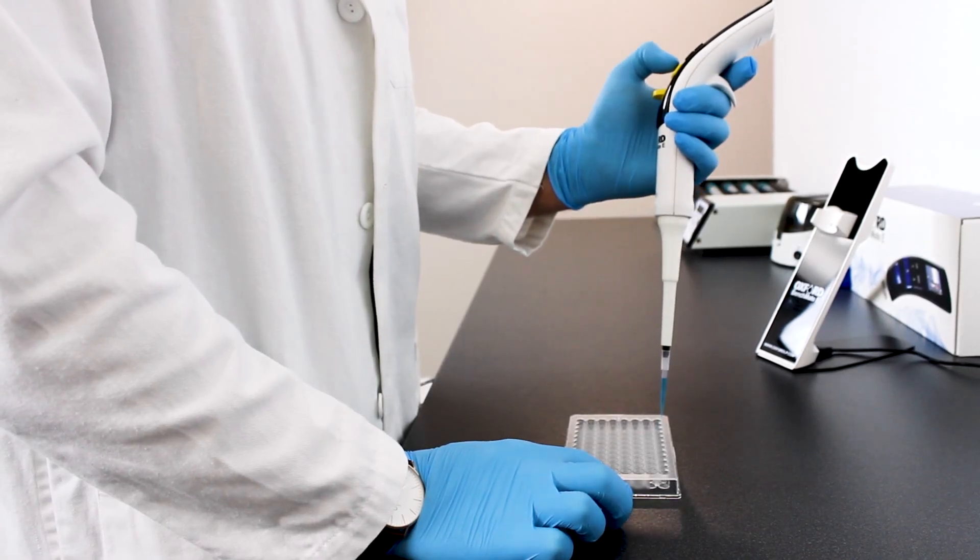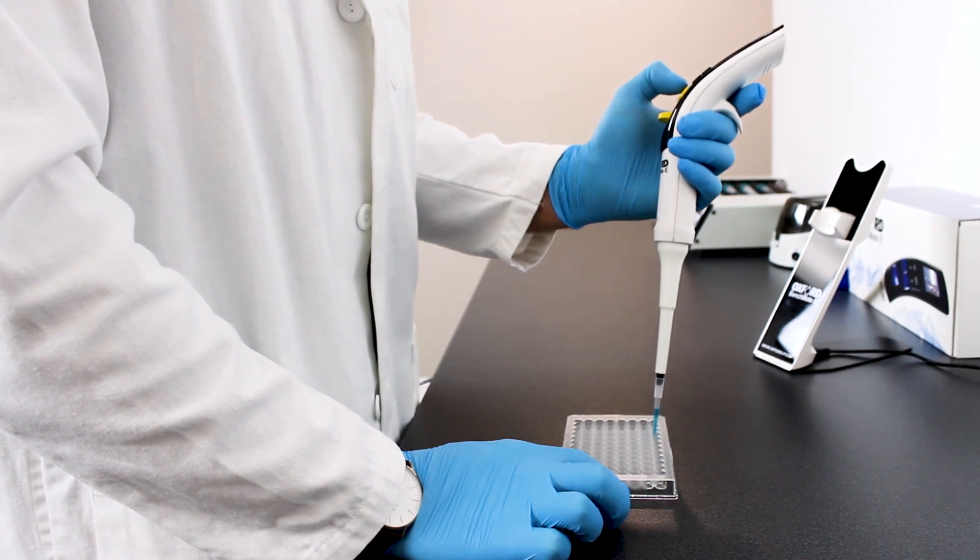The multi-dispense mode is a particularly handy feature saving you time and discomfort during repeated dispensing of the same volume.